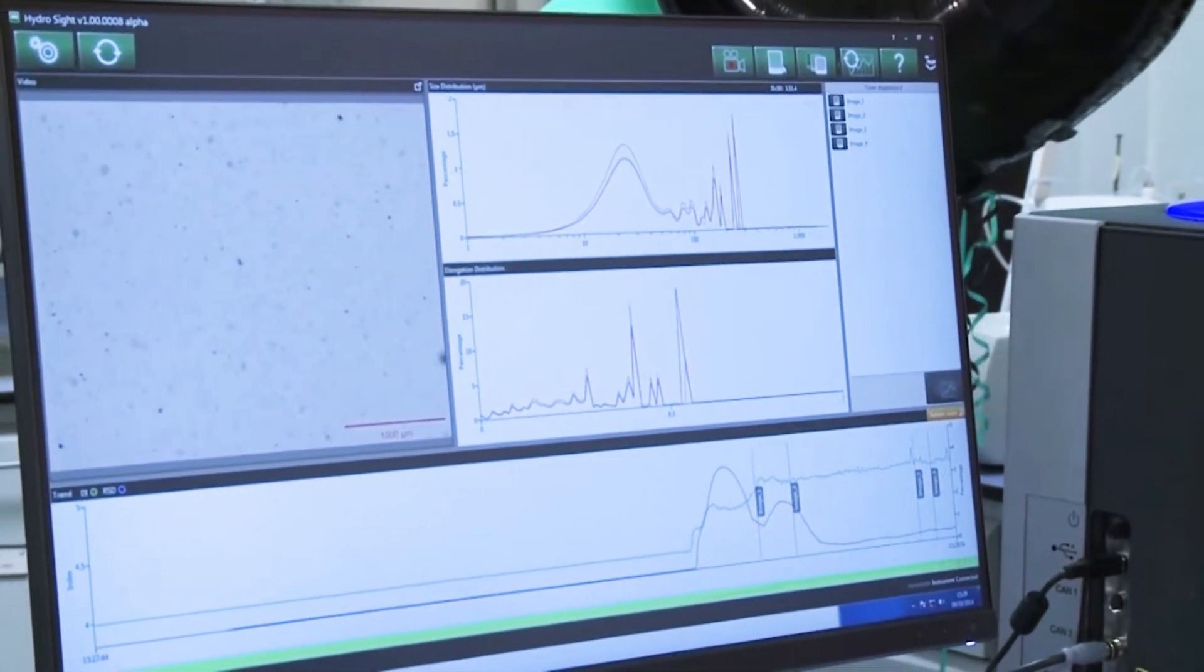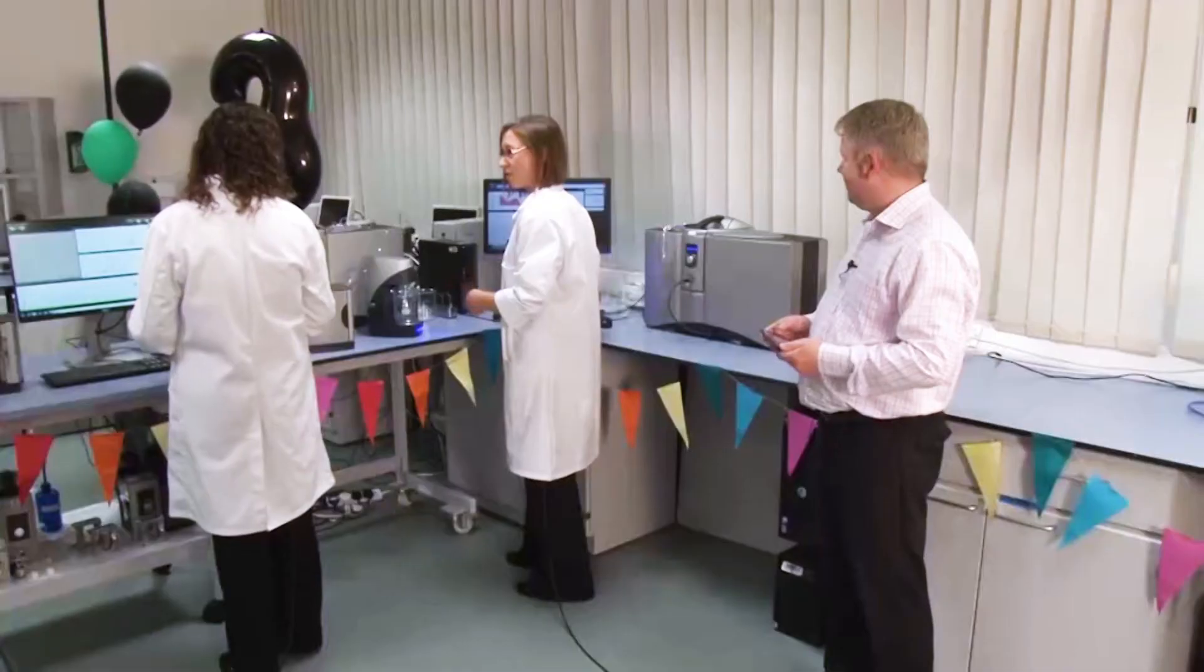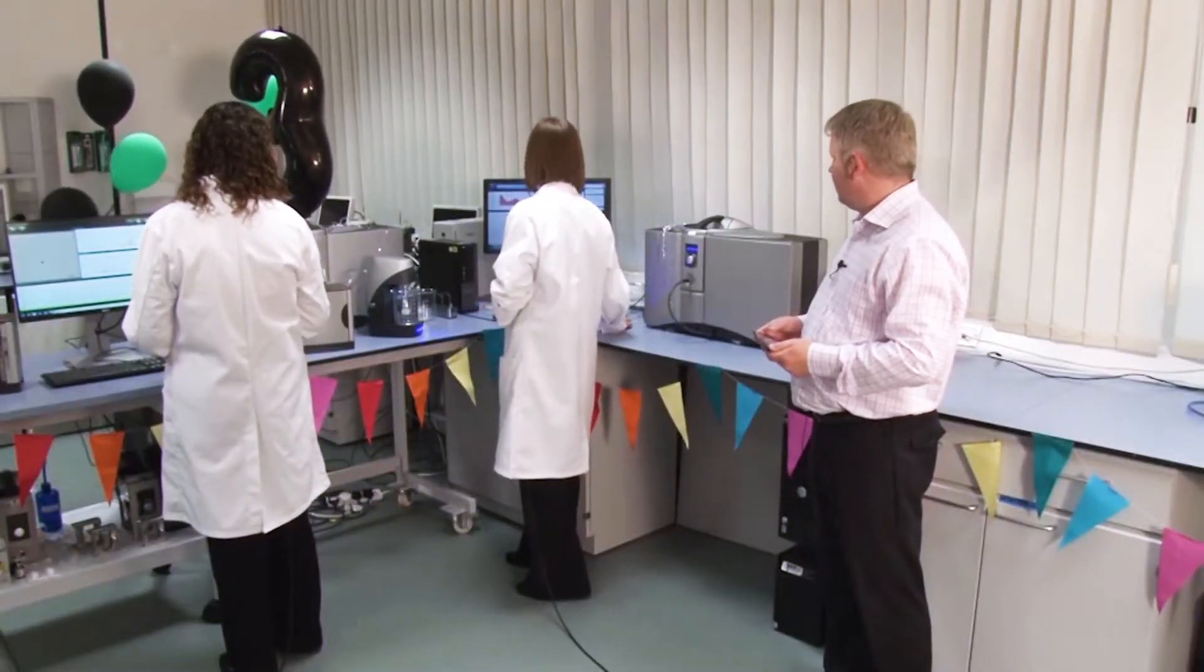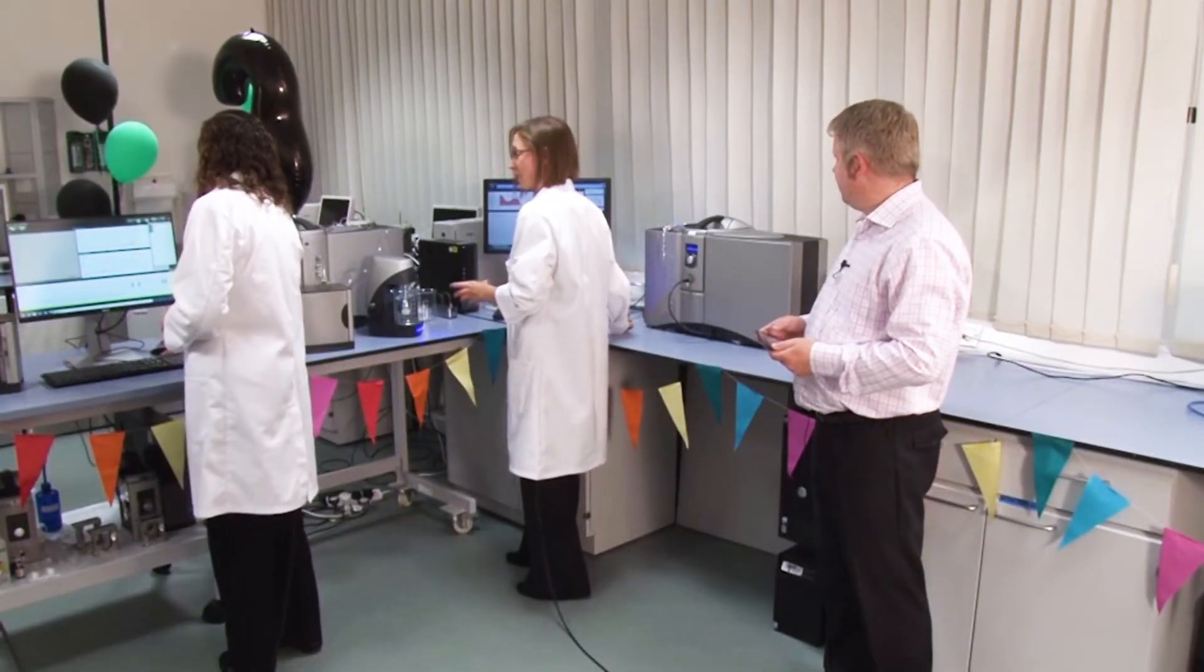Yeah, so normally what we do on the Masterciser is add a little ultrasound to try and disperse the sample a little further. So I'll turn that on and it will get a little bit more noisy.